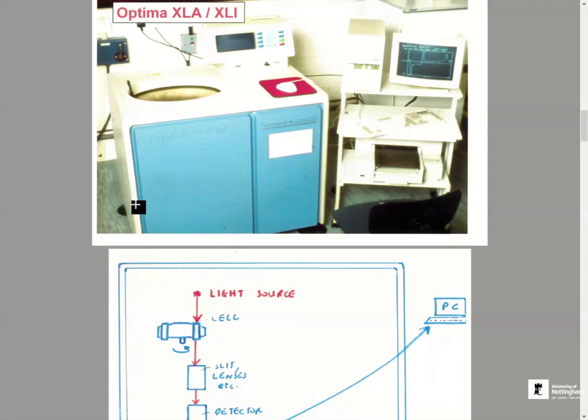Open the door, and this tsunami of water came out of the lab. What happened was, and it shows you how well sealed the doors were in those days, is that the pipe had blown off the back of the centrifuge with the water pressure. And overnight the water just accumulated. There's no drain in the lab, so it opened the door.